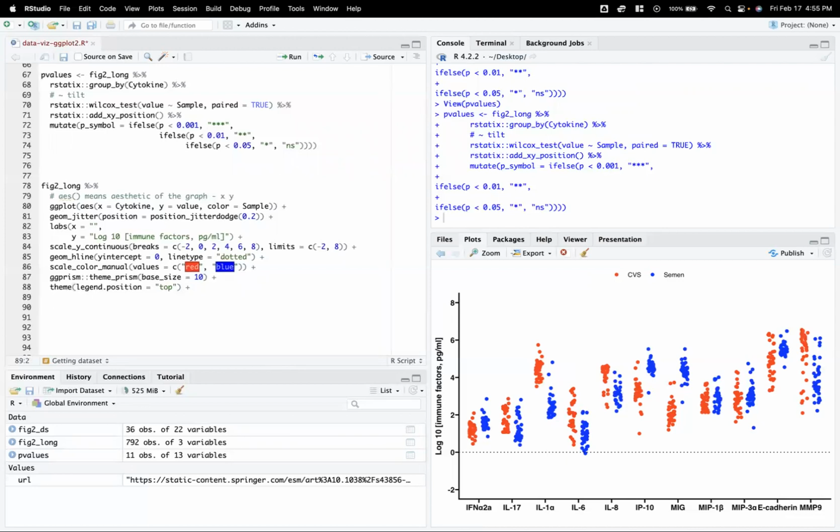So we will put the p-value here. Okay, so we will give a plus sign. I mean, you can give it here, or you can just go to any line on this ggplot area, right? So basically this ggplot graph is created as a layer. First we create a foundation, then we give it a geom_jitter.